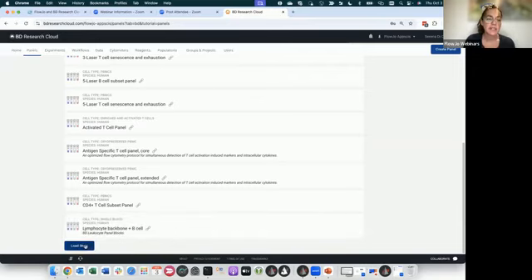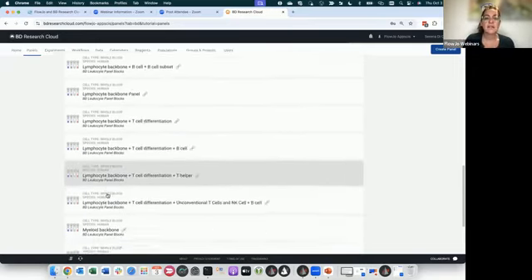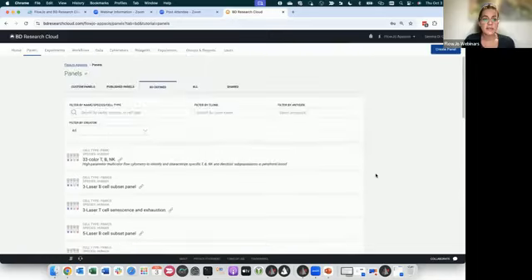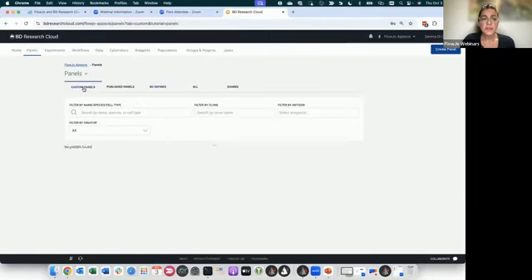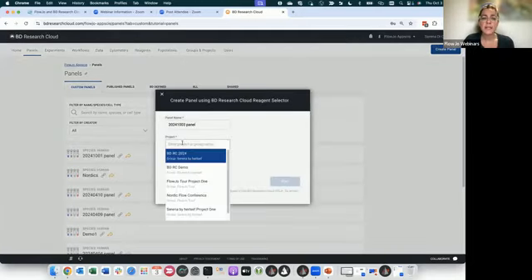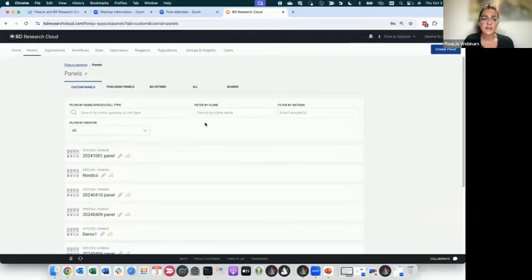These are called panel blocks. And if you load more, you will be prompted with more and more panels that you can eventually combine. In this case here, these are all backbone panels that can be combined in a single experiment eventually. And you will also have the ability to drop in some extra markers in case you're interested in that. So you can create your custom panel if you are interested, and you will just need to go on to create panel right here, assign a name to the panel, assign a project, and then start.